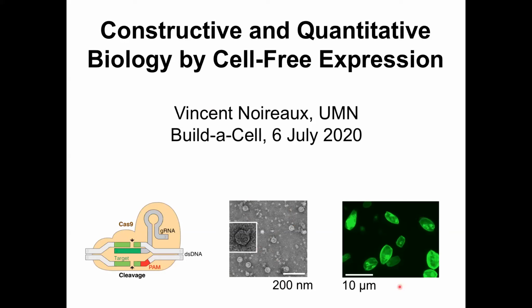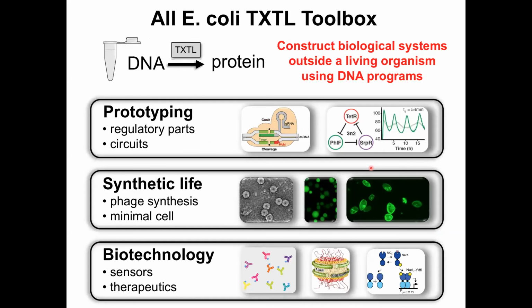And I will focus today, towards the end of the talk, more on the synthetic cell system. You see here some liposomes that were spherical at the beginning, and they take the shape of rods when we express a cytoskeletal protein. But the most important thing here is that it's entropically driven. You need molecular crowding. So, a snapshot of the lab activity at UMN here.